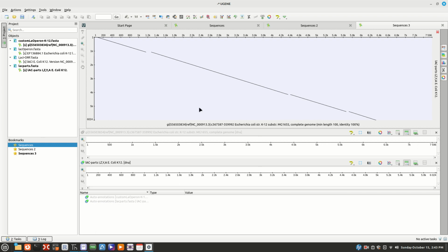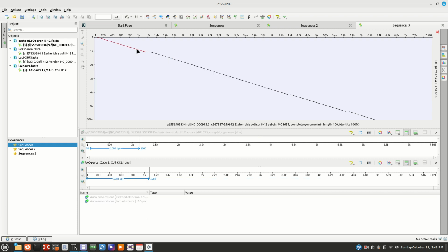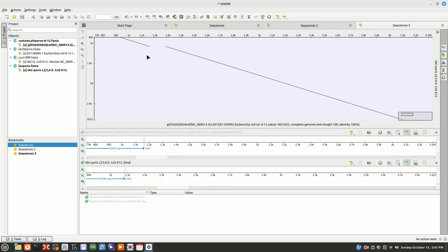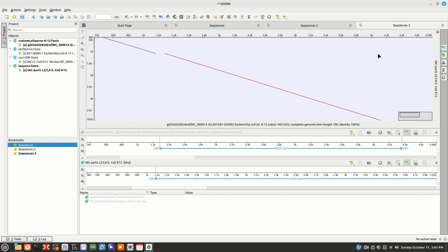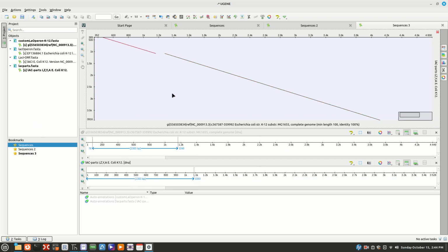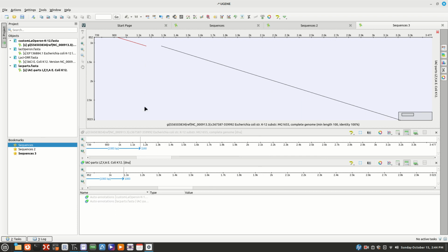And so you can click on this maybe, and you see the region. Let's see if we can zoom in down here, which would be better, I guess, zooming in up here. So we want the regions in between about here and here. Come on, let me click on it, it won't let me click. Oh, that's because we're down here. Ah, okay, now we're back. All right.